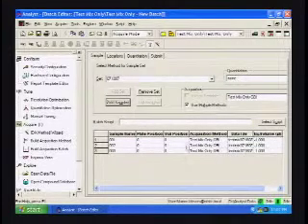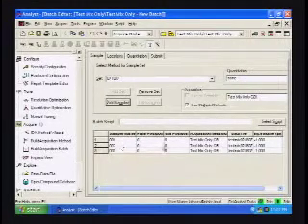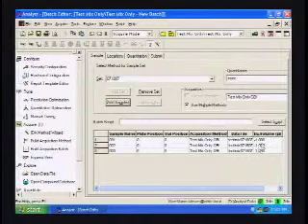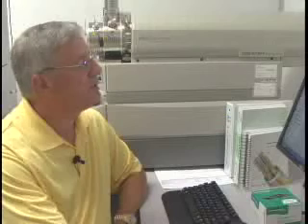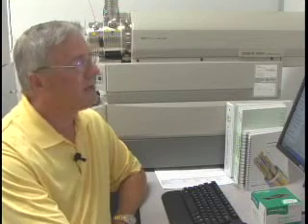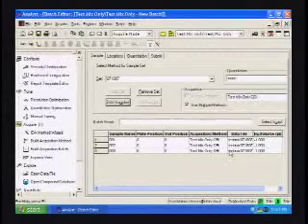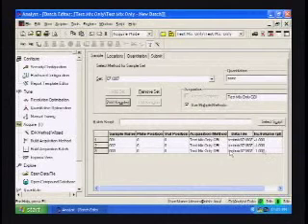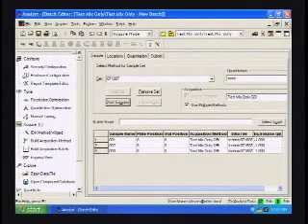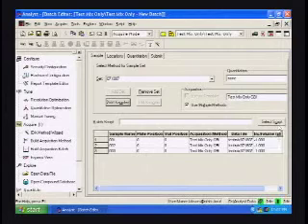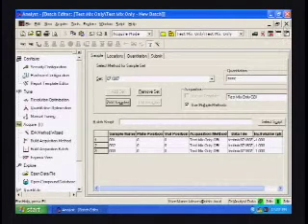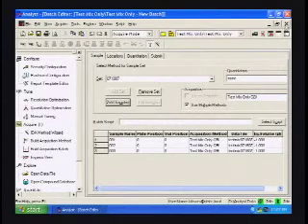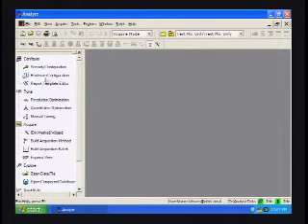At this point, it set up a table here. Now, one thing to note on the table, and this is through practical experience, the injection volume is minus one. Well, in the method that we're using, the injection volume is supposed to be 10 microliters. This is an error message. At this point, what we've done is not useful. It's best at this point to close everything out, because this demonstrates to me that the instrument isn't configured properly.